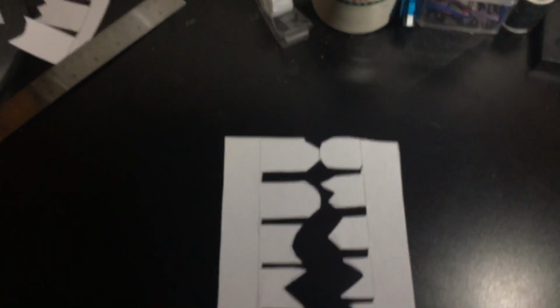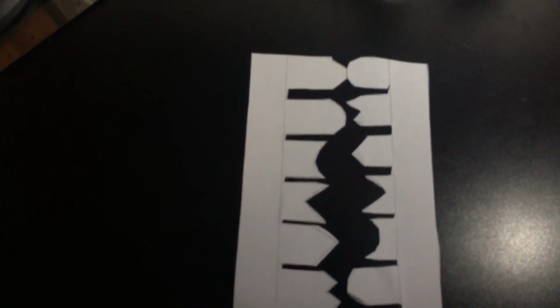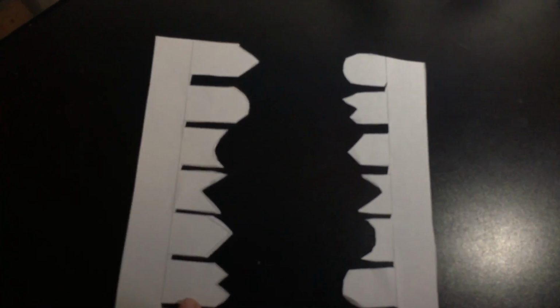So here we have our little DNA strand, and with all the heating and recooling that is going on within the thermal cycler, they actually split apart, and then we inject the primers into the PCR tube, which puts our little primers in there. Then we get our DNA polymerase. Put that there. Once the polymerase gets injected in there, it's like it reads it.